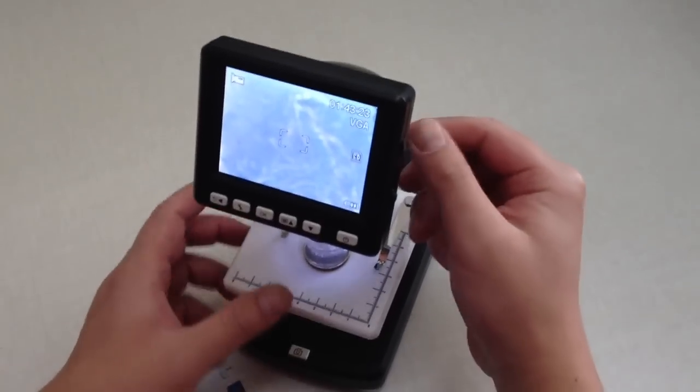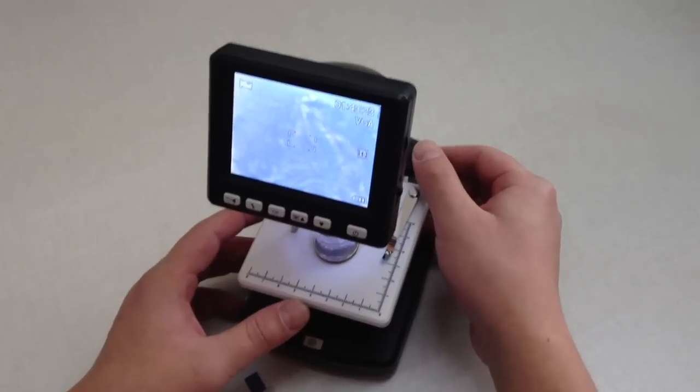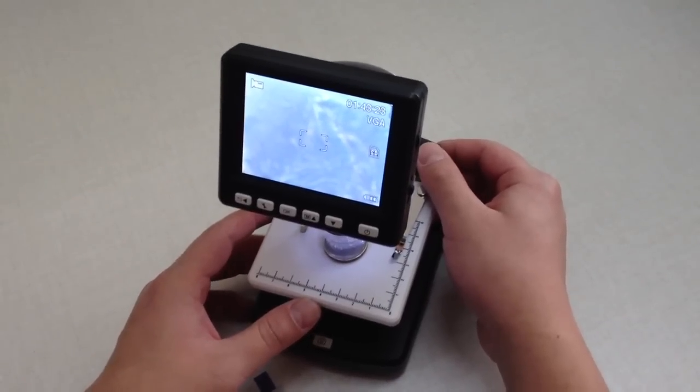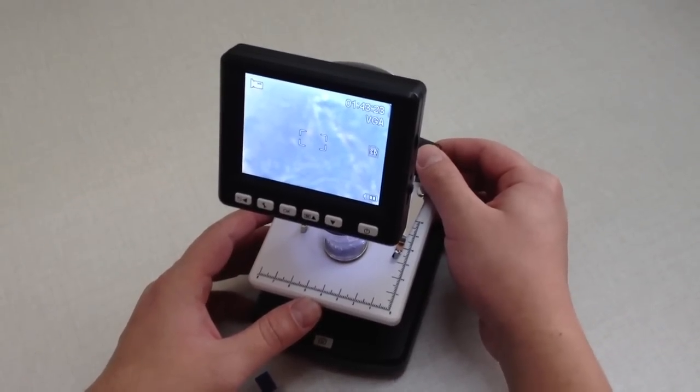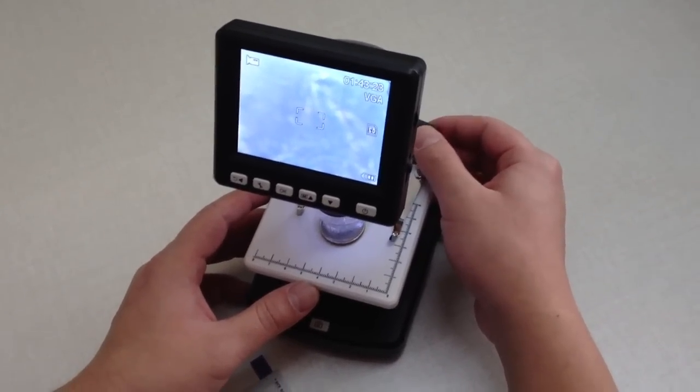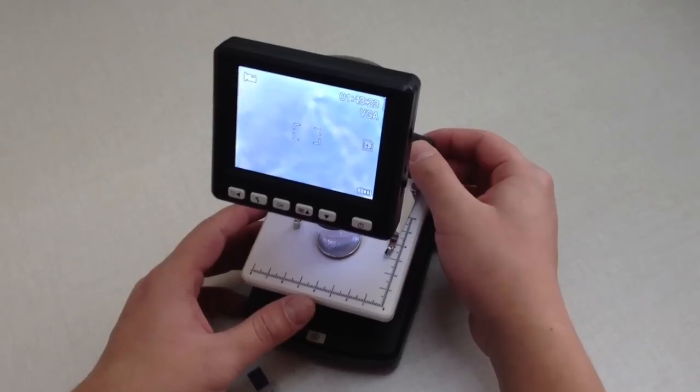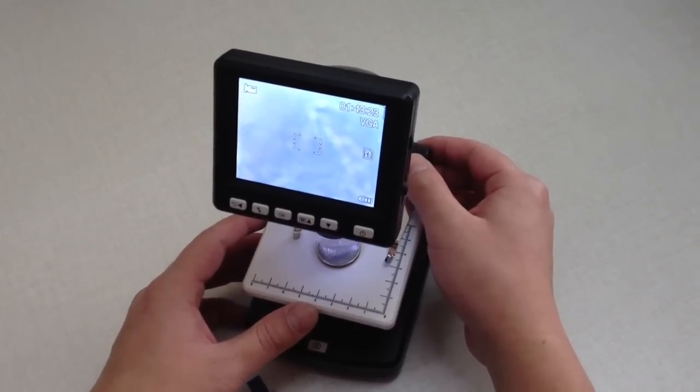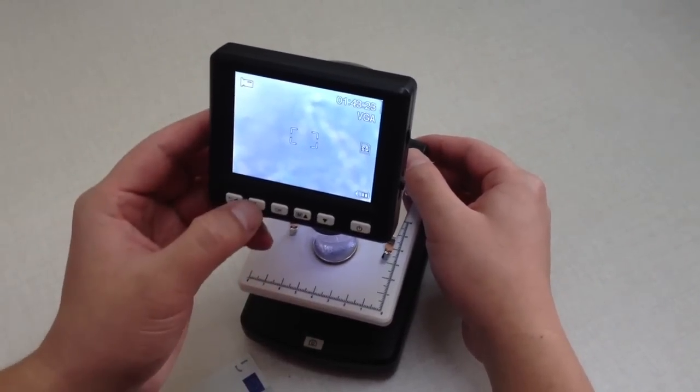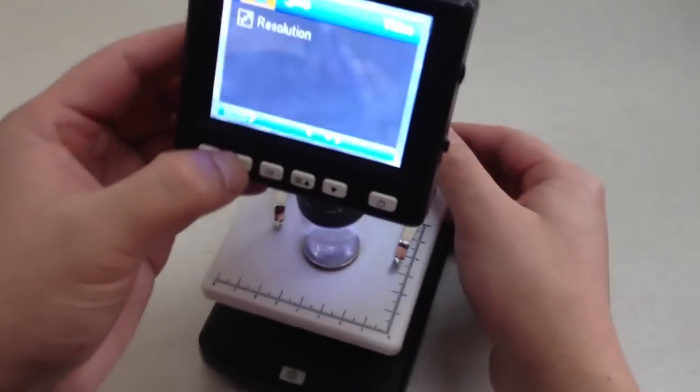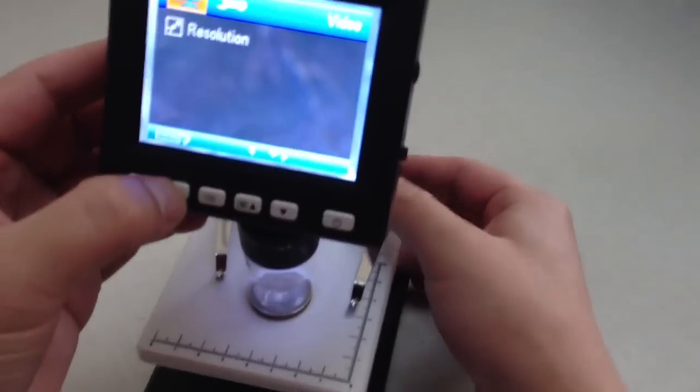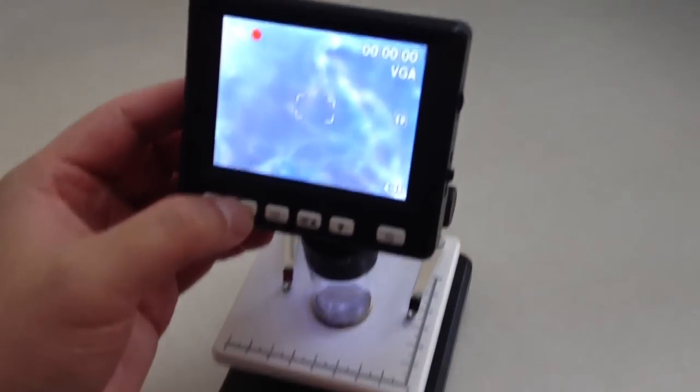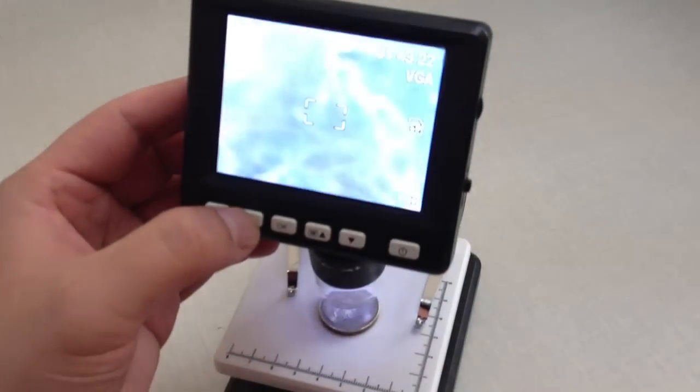Welcome to Archivision desktop microscope. This is for hobby and for education. This device can not only take video, but also take pictures.